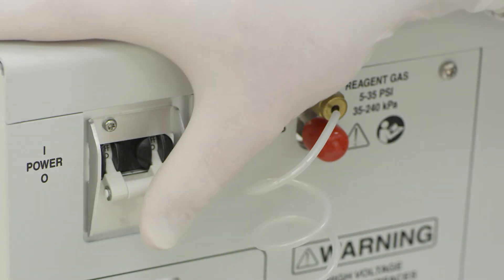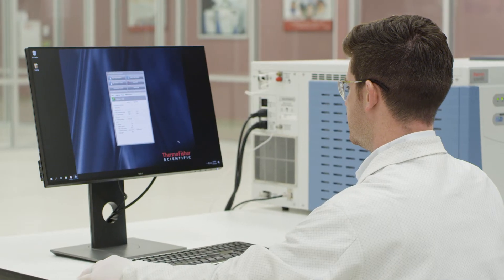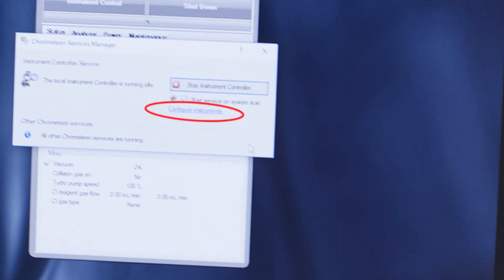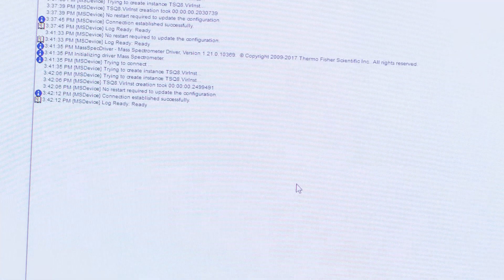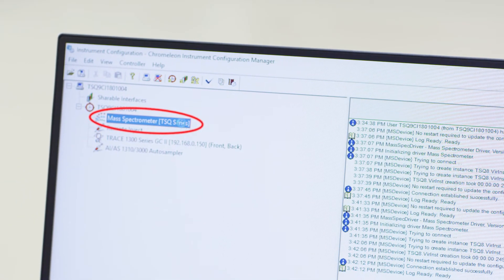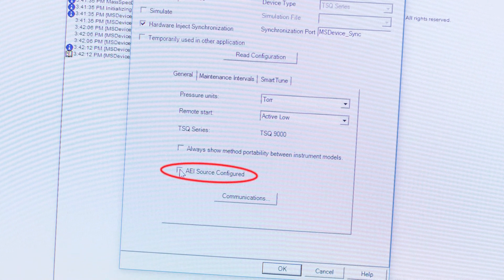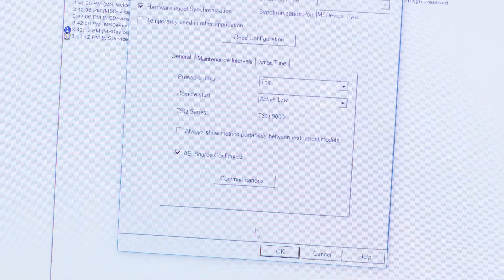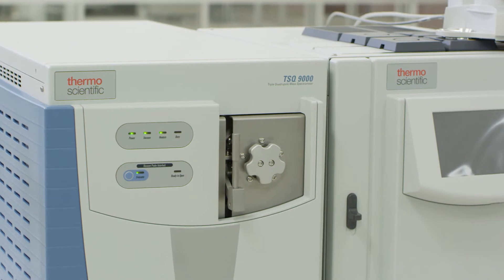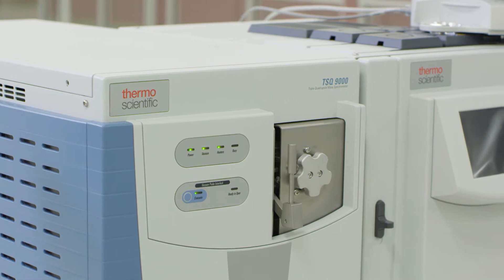Locate the power switch and restore power to the system. Access the instrument configuration in the instrument software and select the mass spectrometer from the list of configured instruments. Check the box for AEI source configured and save the changes. The system is now configured with the AEI source and can be tuned after equilibrating at the desired tune temperature for at least one hour.